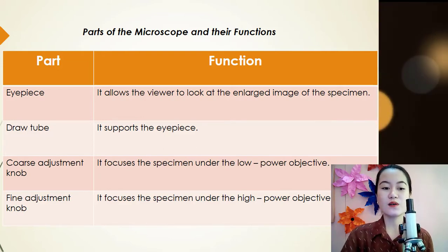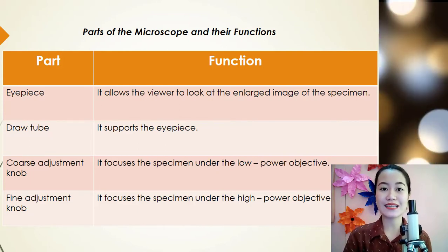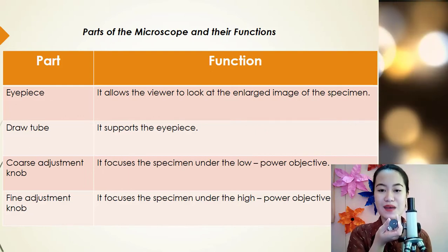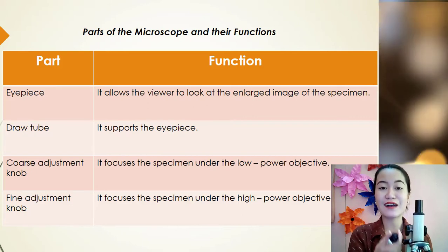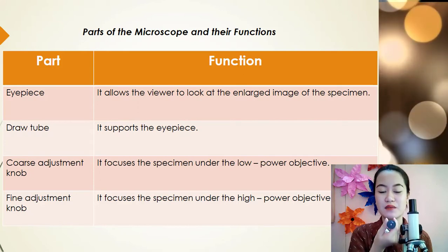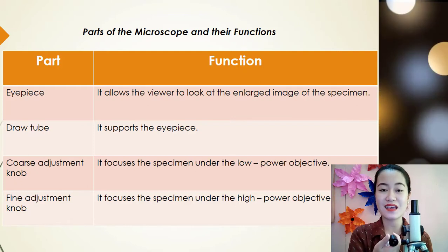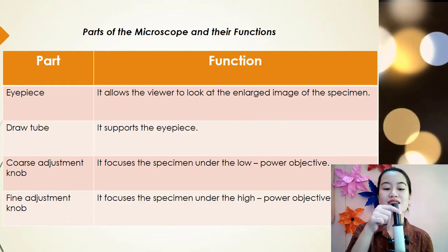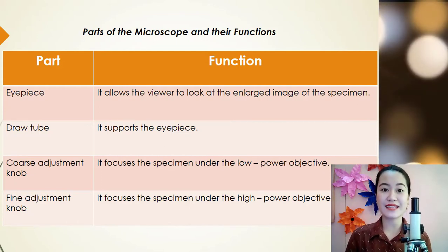Okay, class? So, what is eyepiece? It allows the viewer to look at the enlarged image of the specimen. So, ito yung hindi mawawala sa parts ng microscope. This is one of the most important parts of the microscope, the eyepiece. Kasi kung walang eyepiece, we cannot see the specimen. We cannot see the object. So, that is the function of the eyepiece. Okay, class? Did you understand?